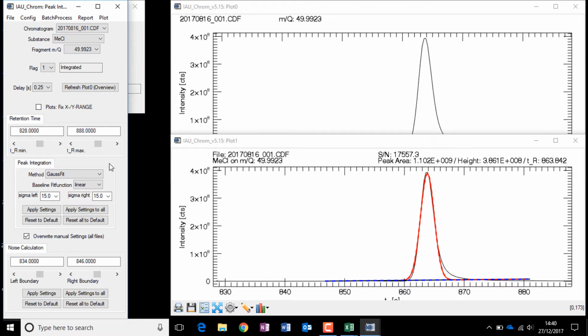And this is useful if I wanted to stop in the middle of an experiment and then come back to it later. I wouldn't have to redo everything all over again. Okay, and that is everything.